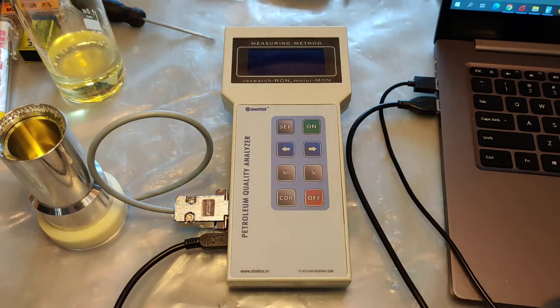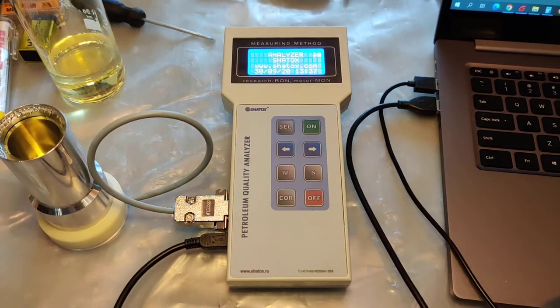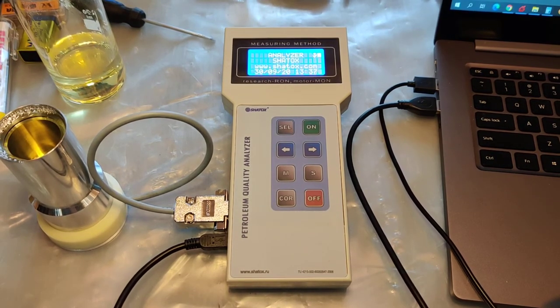Now I switch the instrument on. Have a look at the readings on the screen. We see that the octane number of our gasoline is 96.6. That's it.